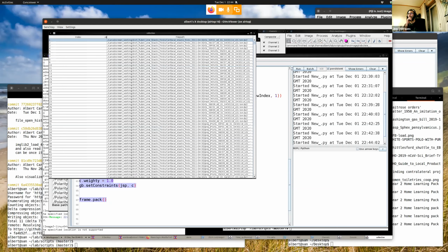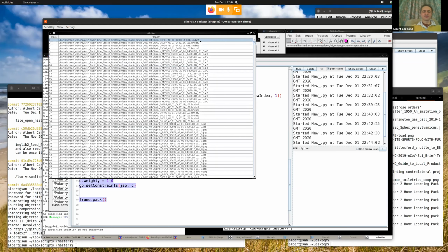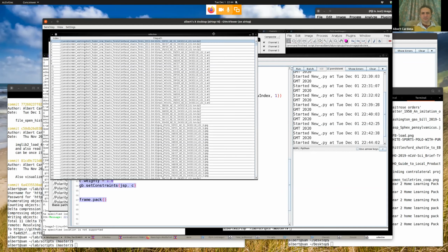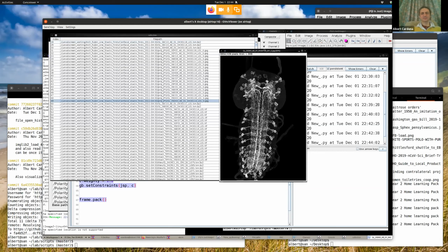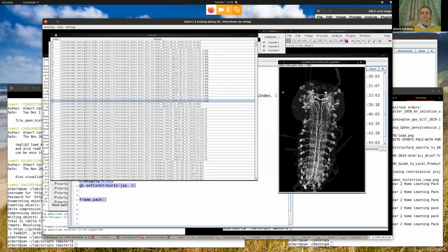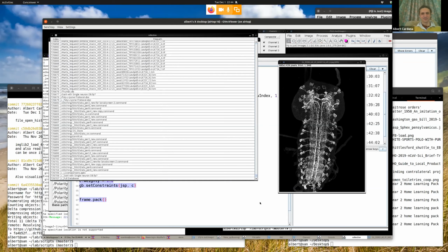So now we can finally see which file we are looking at. Yeah, this was a zip file, which likely ImageJ did not know what to do with or is still struggling to open. So we can just scroll. We want to figure out, here's a JPEG. OK, there it is. Easy. Ta-da! So now we have a very, very simple script that loads the entire collection of 737,000 files. Huge amount.